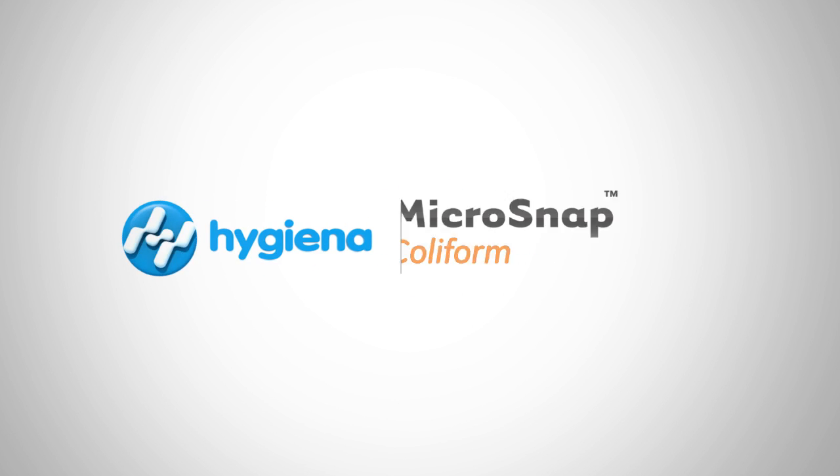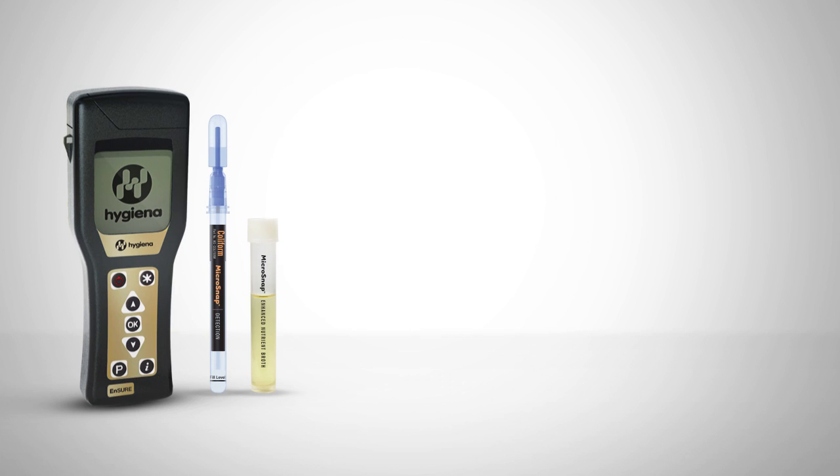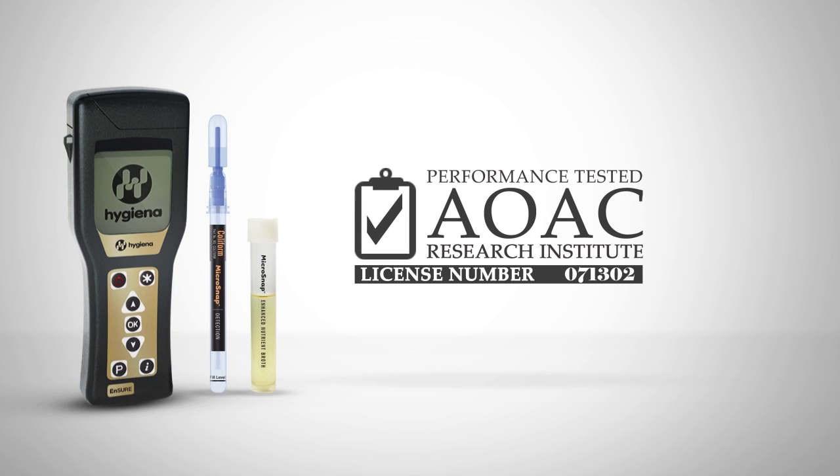Welcome to Hygiena's instructional video on Microsnap Coliform for milk samples. Microsnap Coliform has AOAC approval for the detection of coliform in milk to a spec of less than 10 CFU per milliliter.